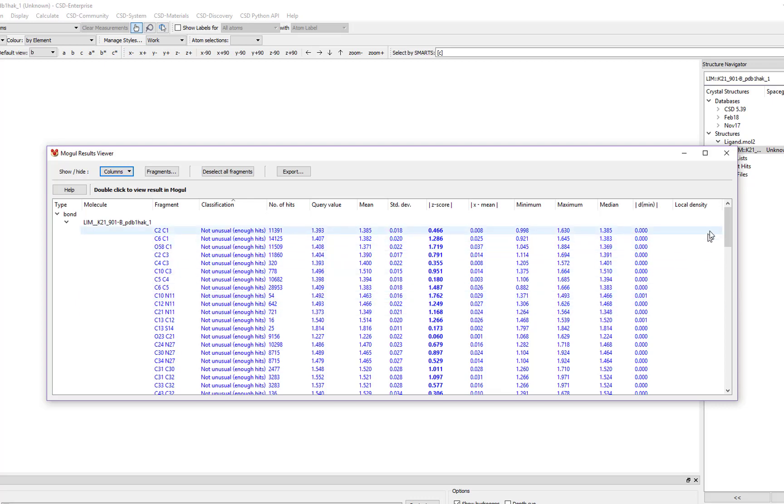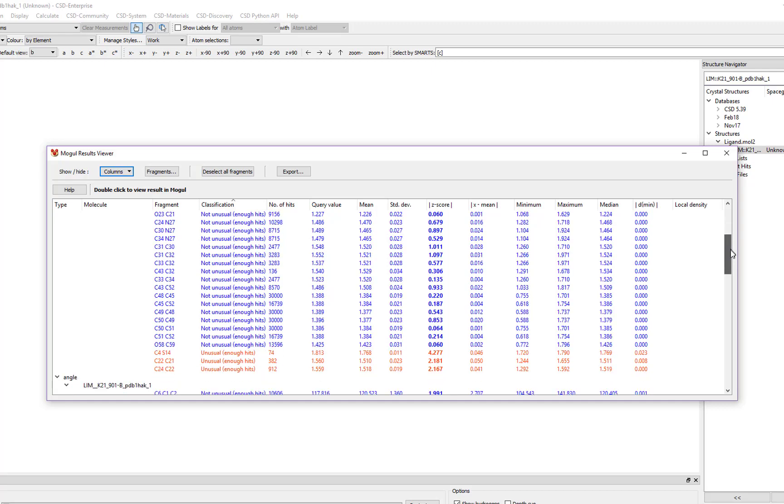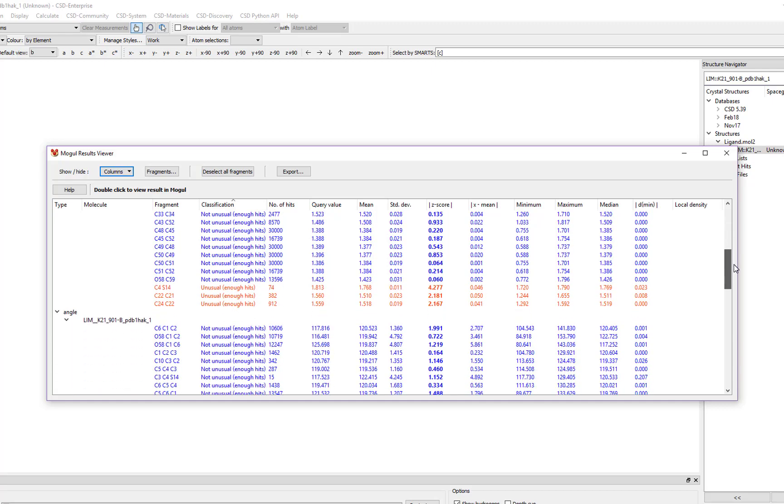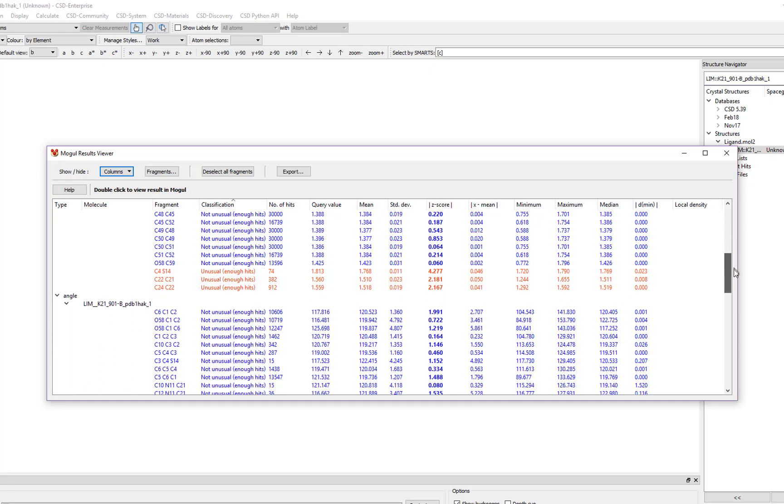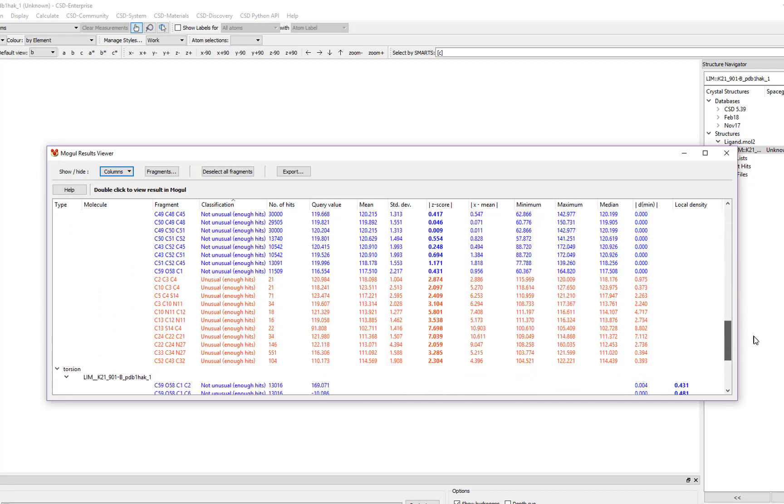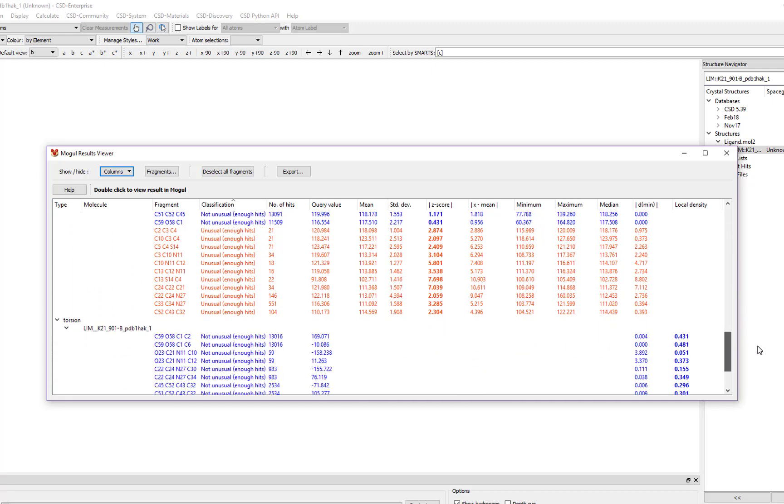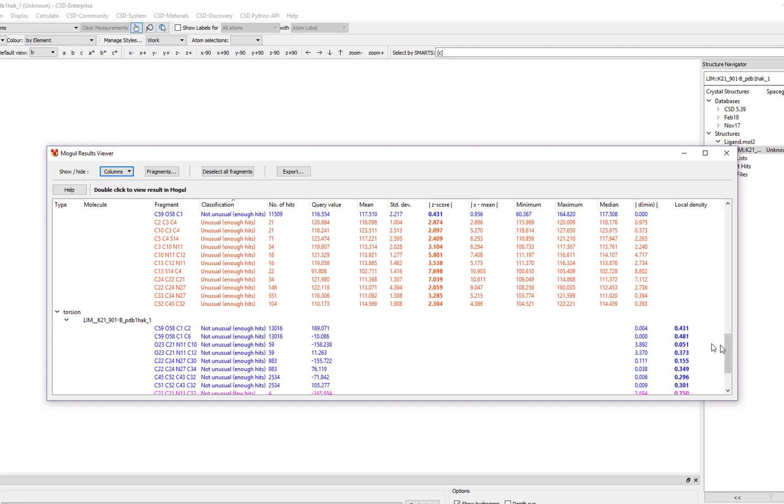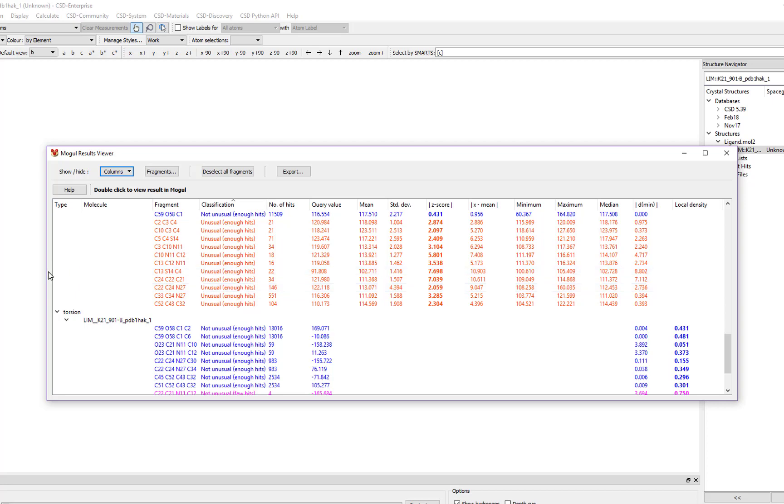You can see it lists all the bonds, angles, and torsions in our molecule. The parameters are color coded such that those in blue are flagged as not unusual with enough hits for comparison, and those in red are flagged as unusual with enough hits for comparison.